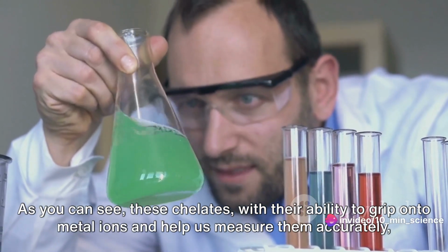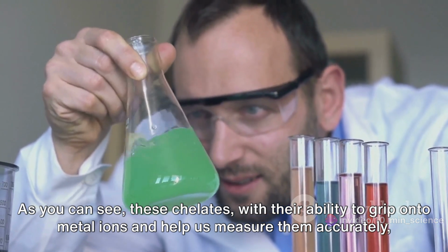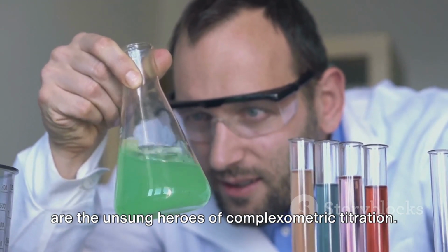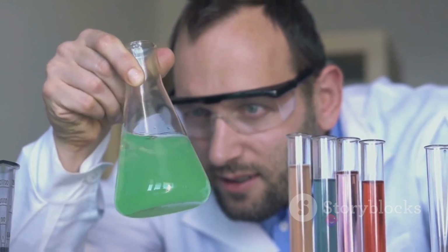As you can see, these chelates, with their ability to grip onto metal ions and help us measure them accurately, are the unsung heroes of complexometric titration. Chelates, the superheroes we never knew we needed.